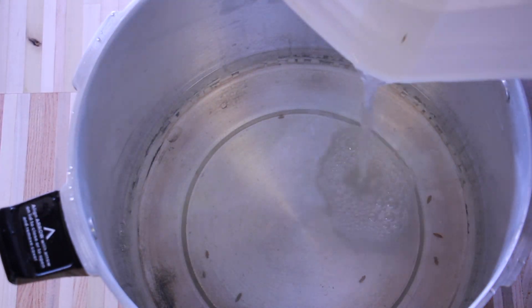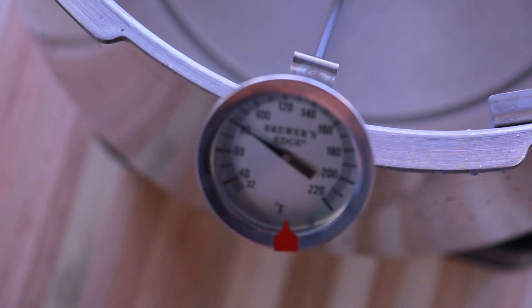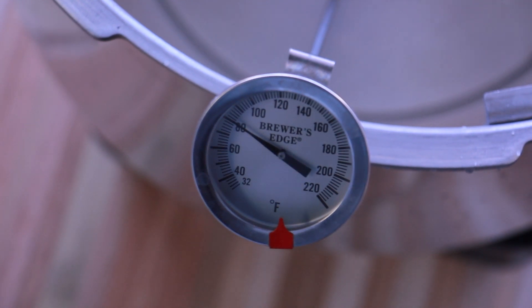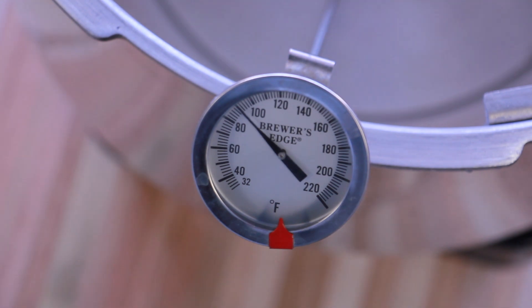The next step is to heat up water to no greater than 170 degrees, and you're going to want to heat enough water to cover your rye grain by about three to four inches. You want to have a pretty good cover of water on top of your rye grain. I ended up heating to just below 160 for mine.